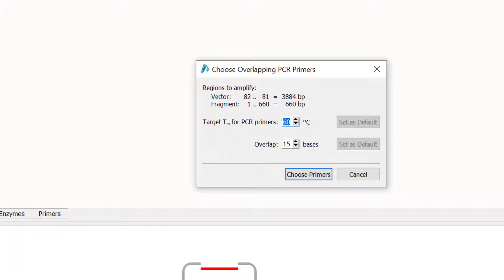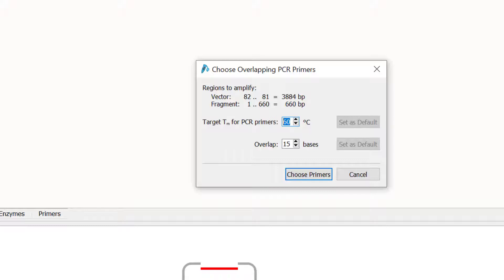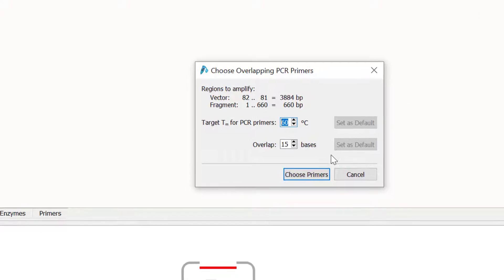It's possible to change the desired melting temperature for the PCR primers, but I will leave this at 60 degrees, which is the default value. You can also specify the number of homologous overlapping bases for the primers. The default setting of 15 nucleotides is optimal for single fragment infusion cloning, so I will keep this and select choose primers.